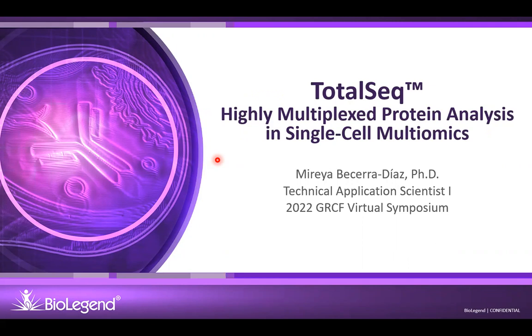In this seminar, I will talk about TotalSeq, a highly multiplex protein analysis in single-cell multiomics.